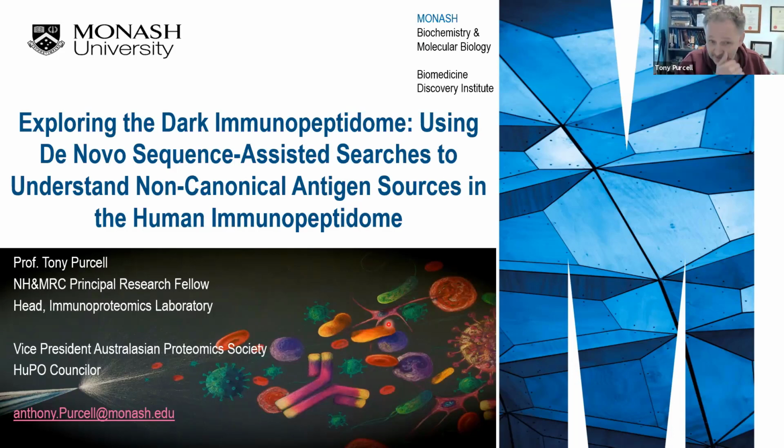I know we've gone over time, and I'll try to save a bit of time because we've heard some excellent introductions to what immunopeptidomics is. It's really gratifying to see just how many talks on immunopeptidomics there are in this Peaks user group meeting. I think that's probably a reflection of many people's preference to use Peaks as a search tool for this type of data. And particularly today, I'd like to talk about the dark immunopeptidome. I'll define what that is in a minute.